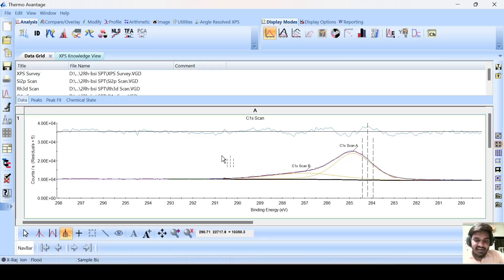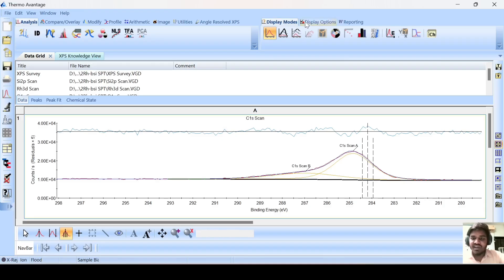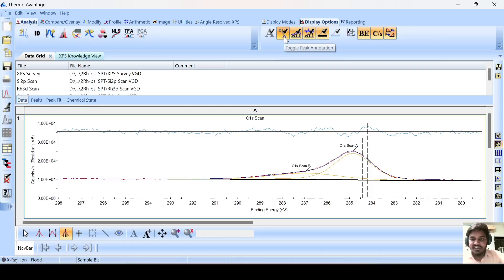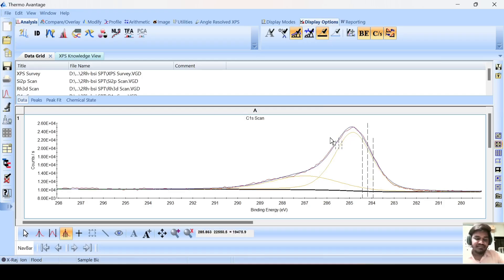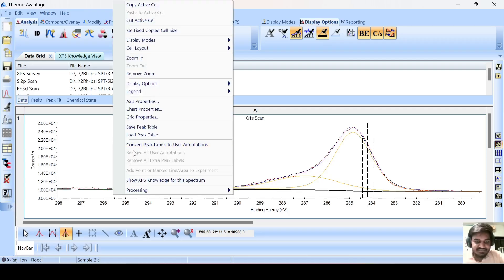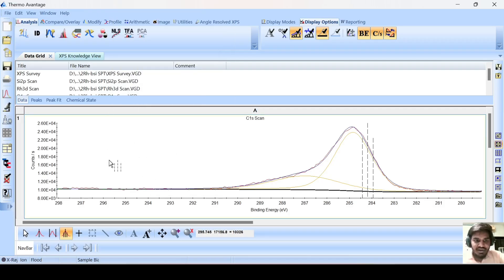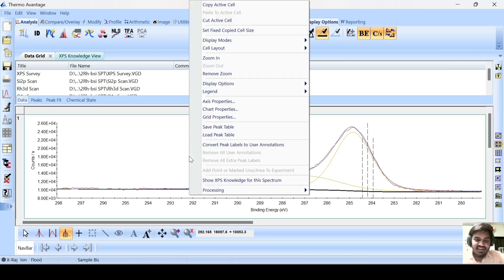Now I will tell you how to modify this spectrum. I don't want this residuals line. Go to the listing option — if you don't want this indication, click on toggle residuals and it will go. To modify, right click, go anywhere on this spectrum. Click the right button and go to chart property.